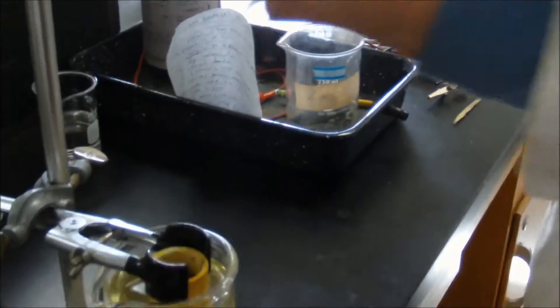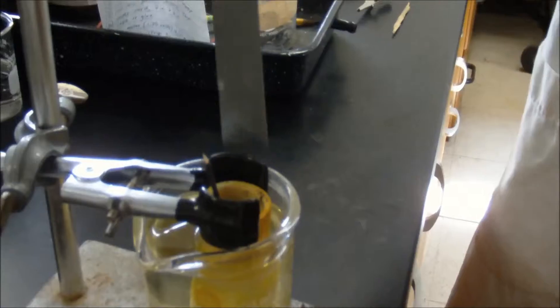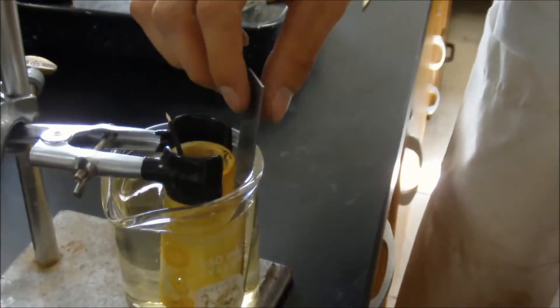As you can see, this is graphite from a pencil and this is a zinc strip. So what I'm going to do now is put the graphite into the porous cup and the zinc strip into the beaker. These two shall conduct electricity to make our fan over here turn.